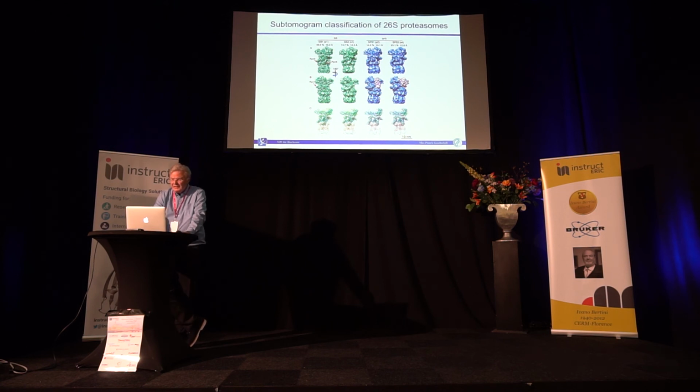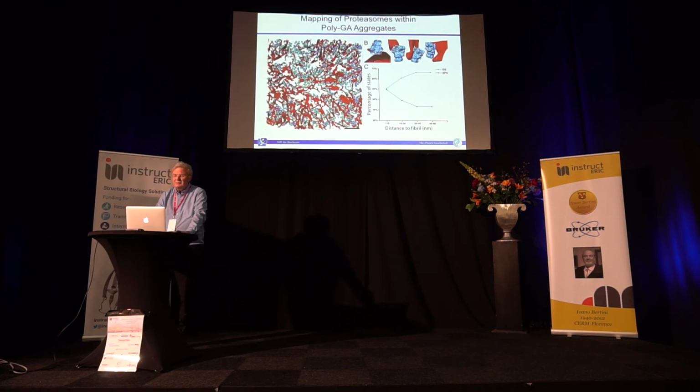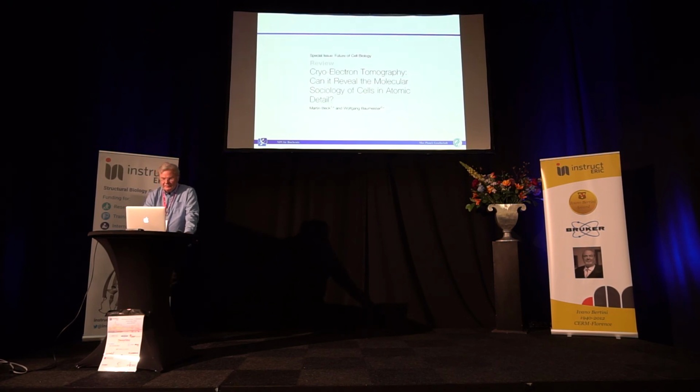So the idea is maybe this is substrate, and we can show that directly. We can map all the blue ones back to the tomogram. And indeed, they are in direct contact with the aggregate material. So, I think I will finish here with the data.